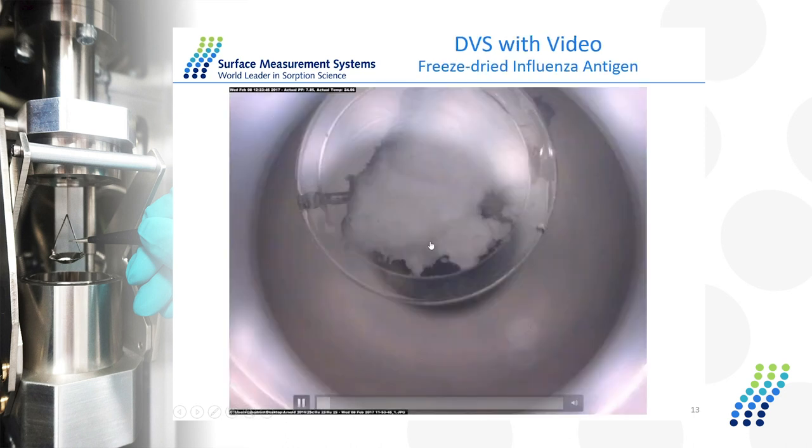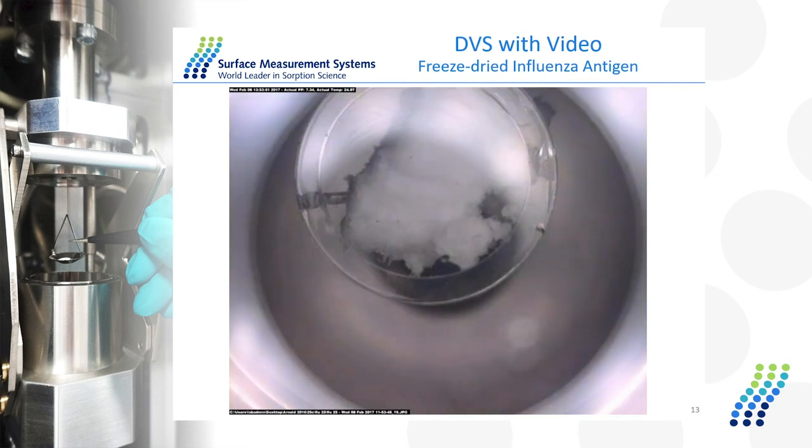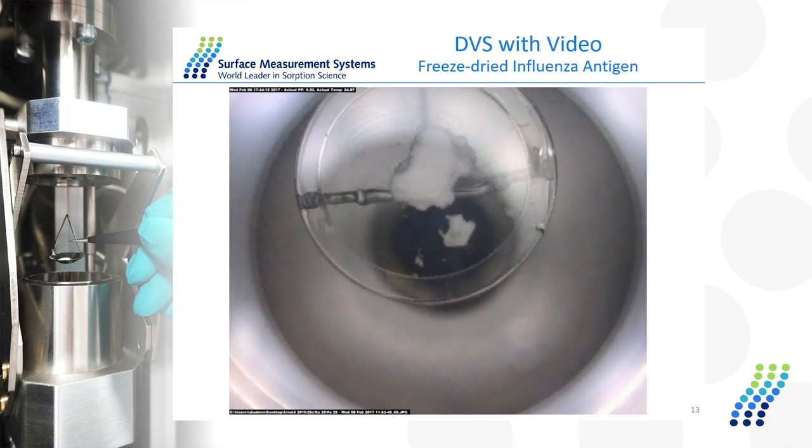And another example with freeze-drying material, where the sample at a certain humidity will shrink and then collapse and then go to a liquid form in the end. So here shows the video function is a very powerful tool to get some change in nature along with the DVS data.